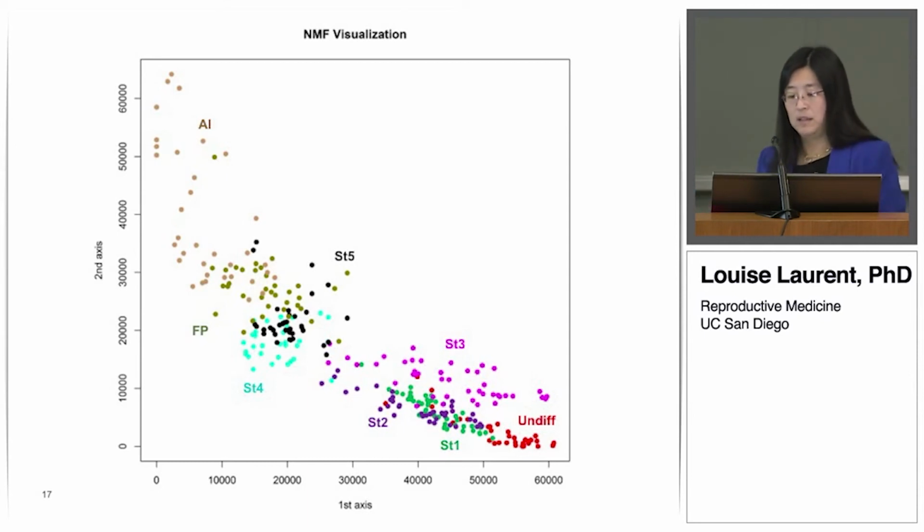This minimizes the problems that we might have with poor sampling of transcripts, especially low expressed transcripts in cells that don't have a lot of reads. So we do throw away some libraries at the data analysis stage that don't have sufficient numbers of counts.